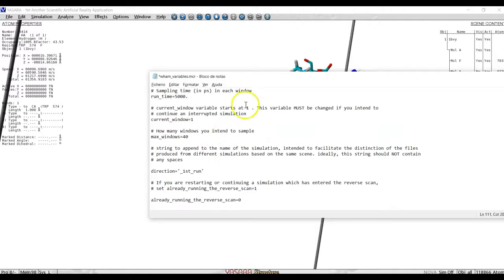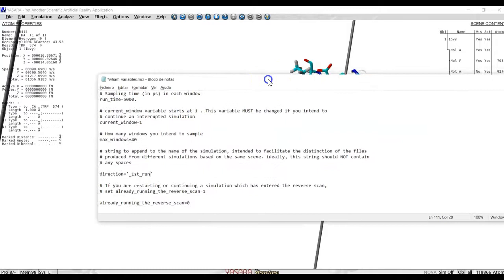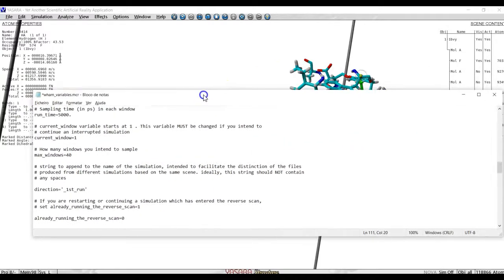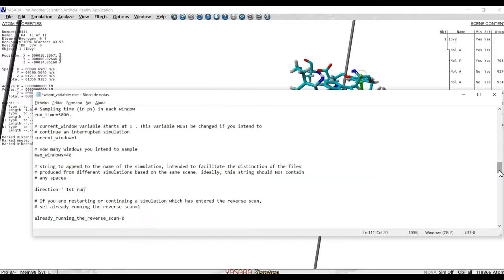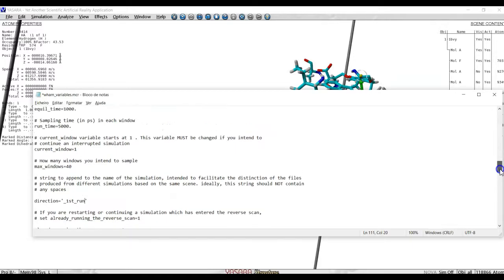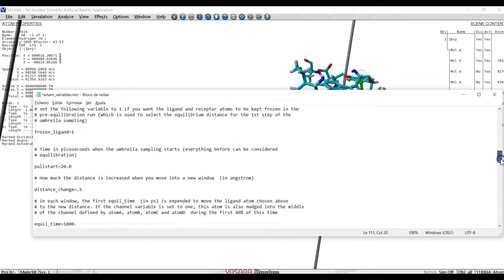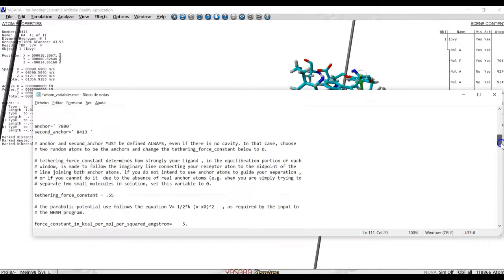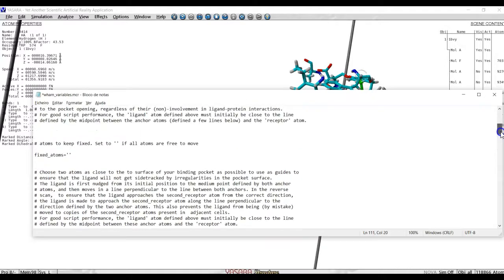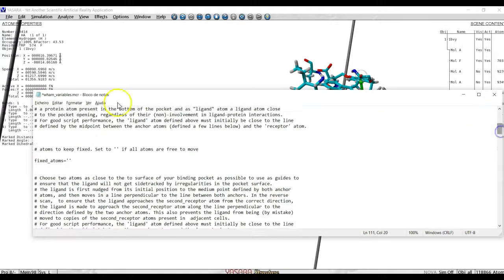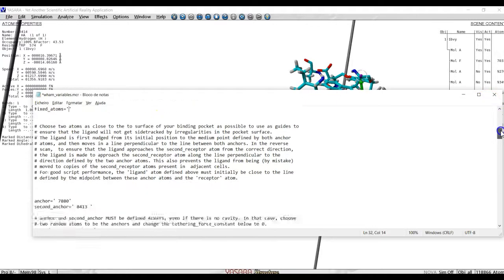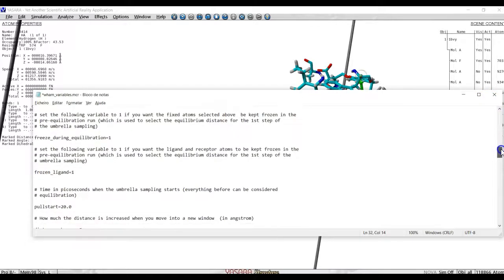We can freeze atoms. If we want some atoms to remain frozen, this happens often. We want, for example, to keep the receptor atom frozen and the anchor atoms frozen, we select it here, in fixed atoms, by writing here the names or numbers of the atoms that we want to keep in place.